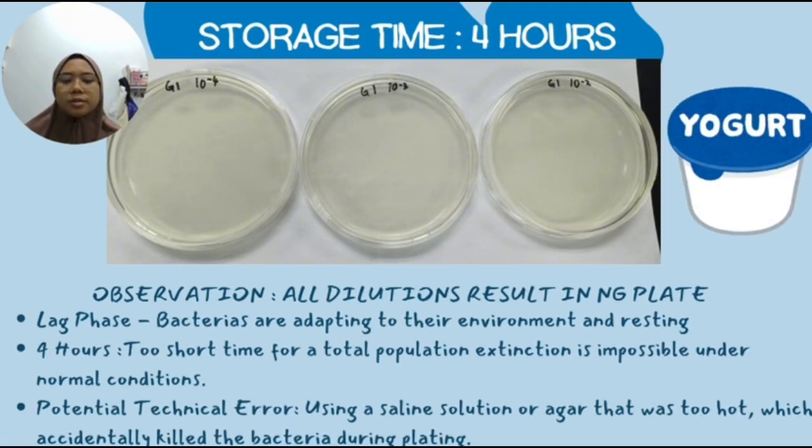This points to an experimental mistake rather than the natural bacterial behavior, such as using a saline solution or agar that was too hot and accidentally killed the bacteria during plating.